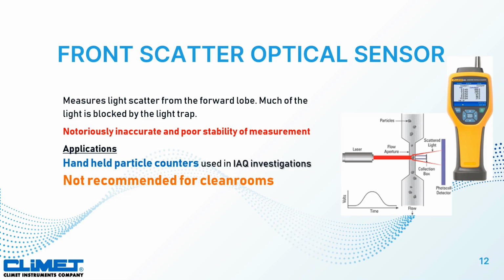Subsequently, handheld particle counters are absolutely not recommended for deployments in life science cleanrooms. Where they do make sense is when used in IAQ, or indoor air quality, investigations, where you're trying to measure large variances in particle concentrations.